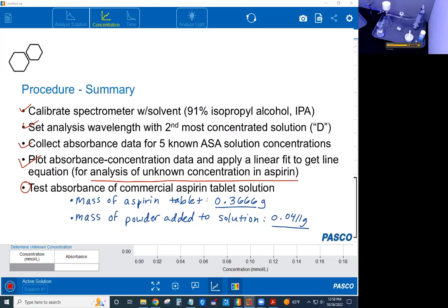Okay, so here's how we make the aspirin solution. You get the 325 milligram version of aspirin tablets from over the counter. This is the regular strength aspirin, 325 milligram. Make sure the aspirin tablets are still good by checking the expiration date. But a fun thing to do is, on purpose, get some expired ones, because you wouldn't expect expired aspirin to still be at 325 milligrams.